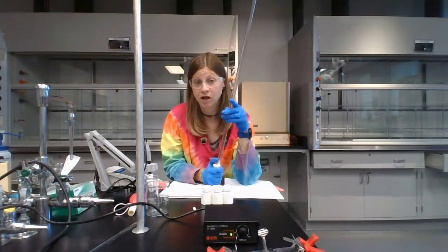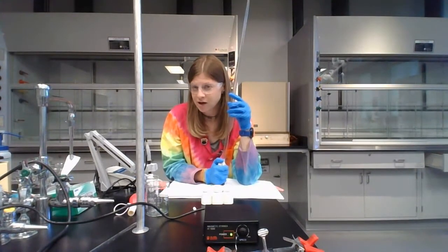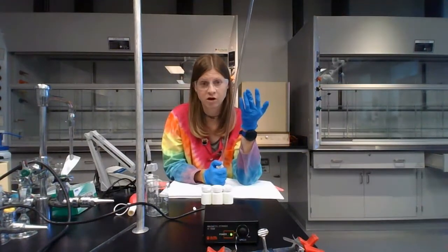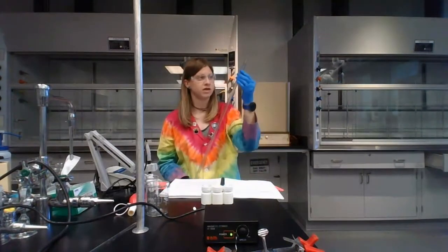So watch the video on how to use a burette to learn how to condition and then load the burette. Now, in that video about how to use a burette, the video tells you you don't have to fill it all the way to 0. You can start and stop. You can fill it to whatever value you want as long as it's within the markings.